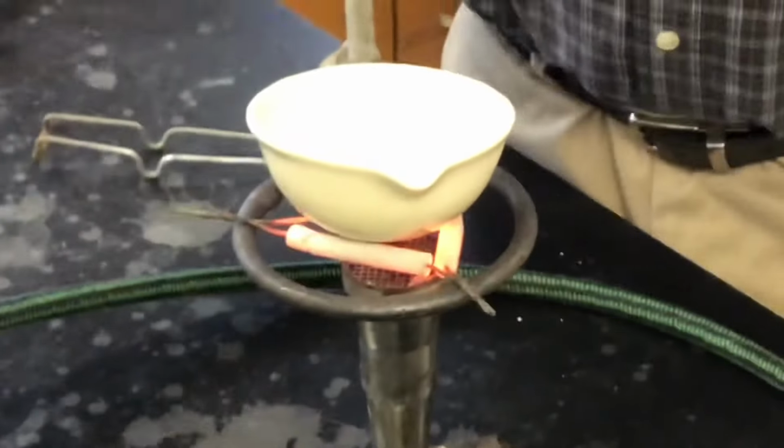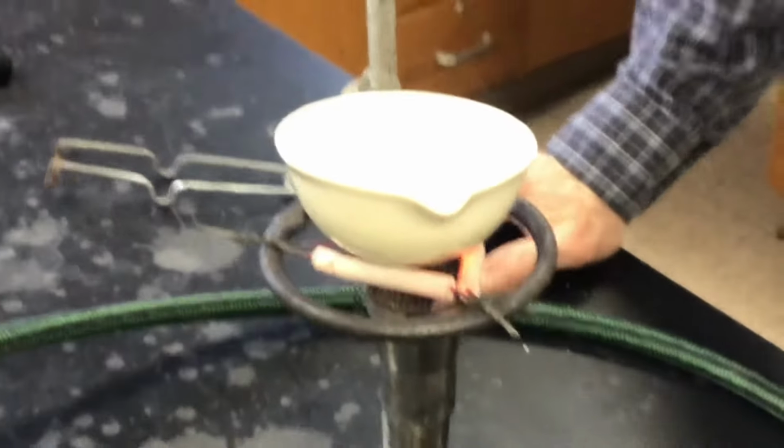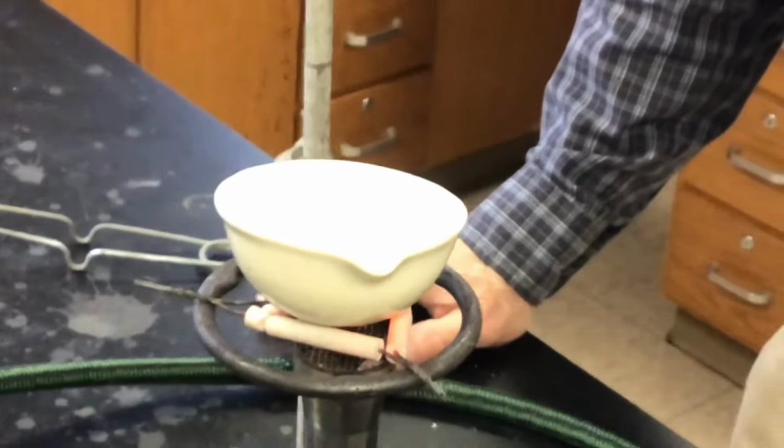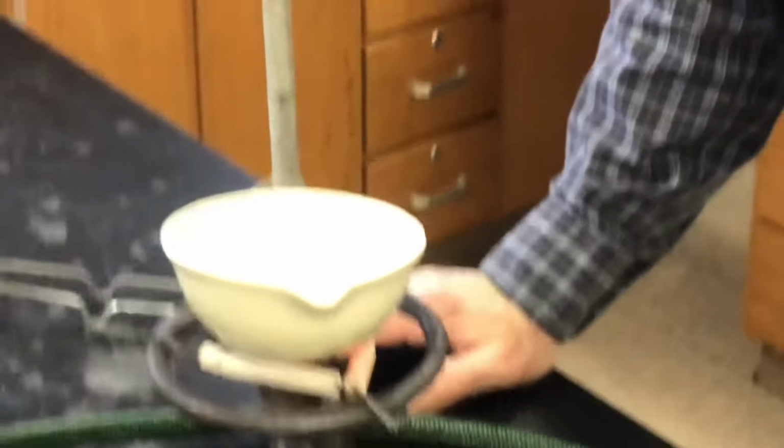Yep. Now we're going to have to let it cool. We can't just take it off and put it on the balance immediately. Yeah, Mr. Hevel is tough, but I don't think I'm going to ask him to grab onto that dish now. We'll let it cool down and get back to you.